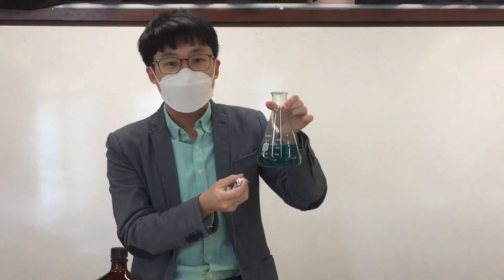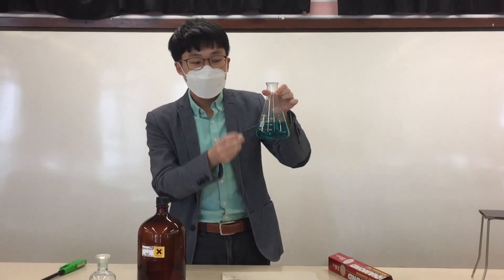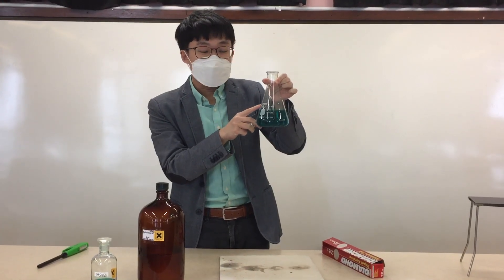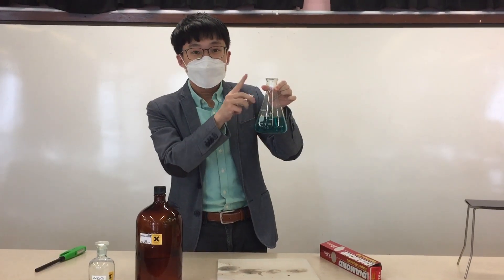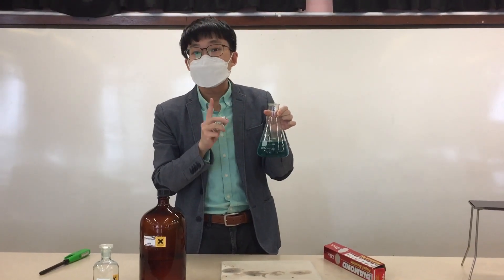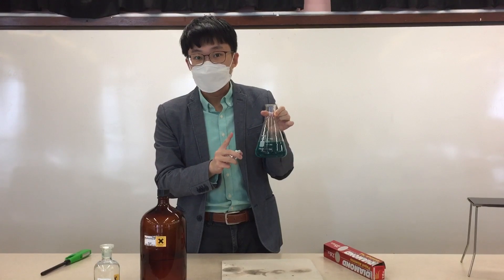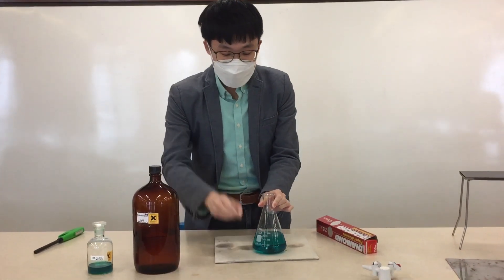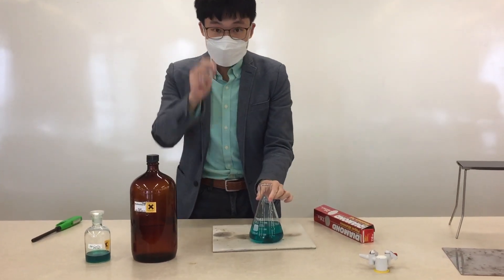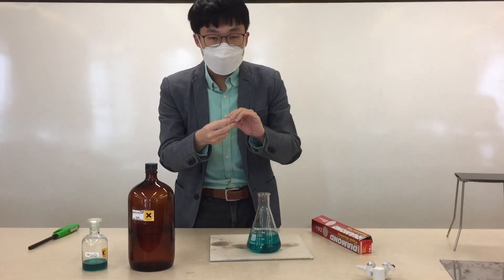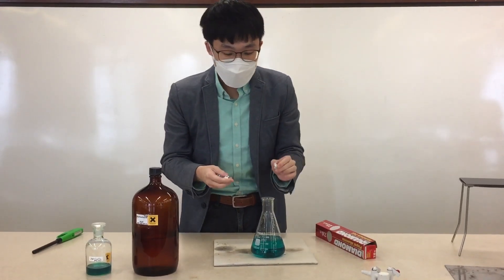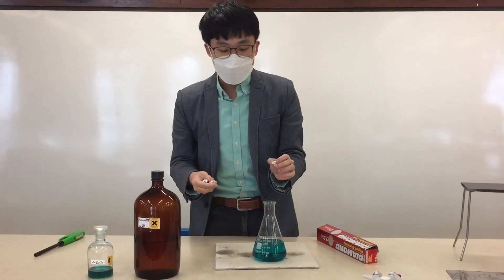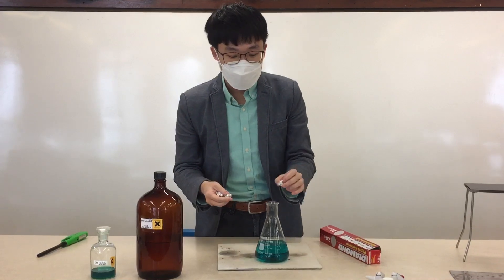You might not predict what would happen. After we add it, you should be able to see some foam, and we are going to light it up as well. Please observe the change on the aluminum foil — we are going to switch off the light to have a great demonstration.